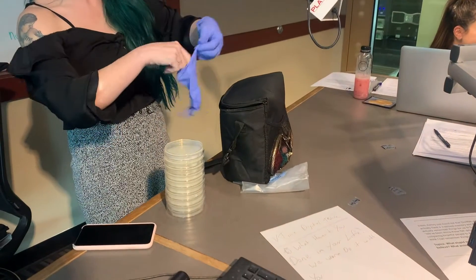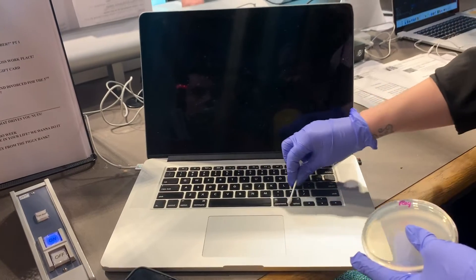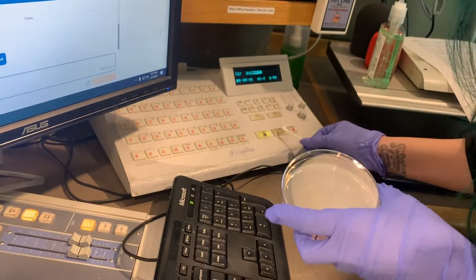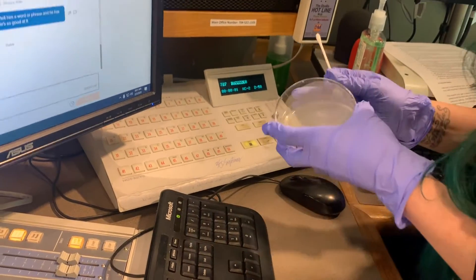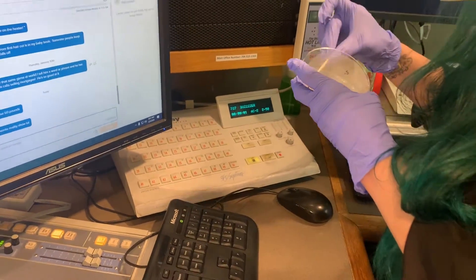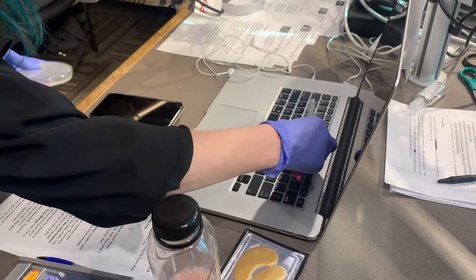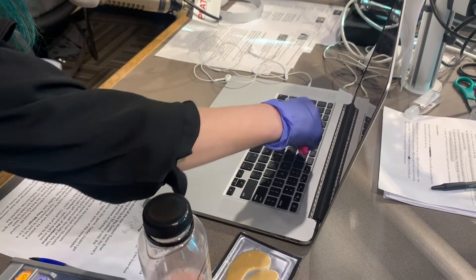We are just taking a sterile swab and getting a little bit of moisture on it. And then we are swabbing things that we think might be germy, which is probably going to be everything because bacteria are everywhere. We'll swab it onto this agar plate, and then stick it in an incubator for a couple of days. Whatever we can't see here, we'll grow here and we'll be able to see it.